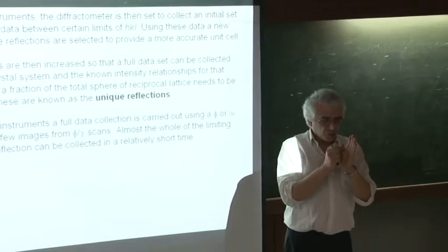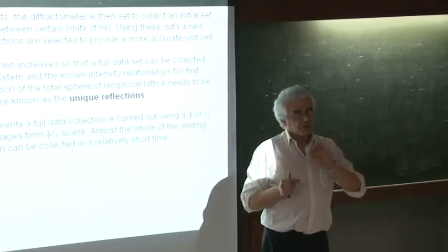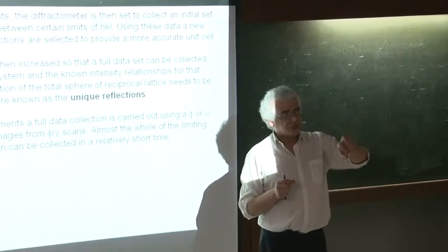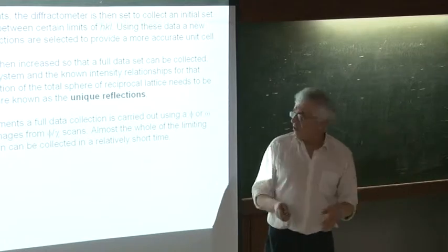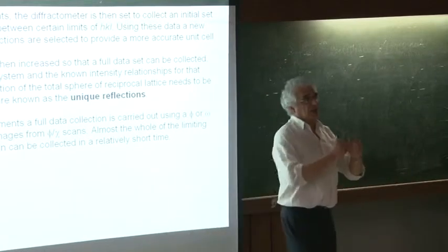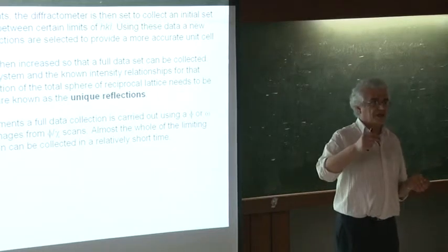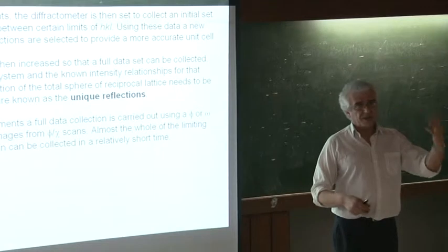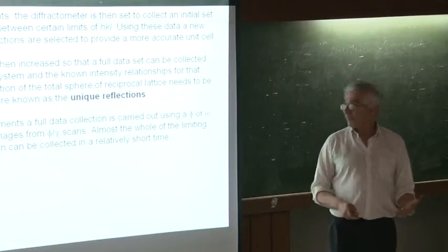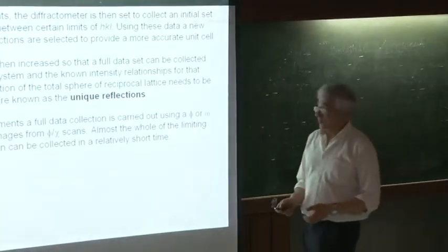Before the peak, after the peak, the height of the peak, the background. We would do a very careful scan to get the intensity. These days, with these images that we get, you collect everything at the same time, and then you do your calculations later by image processing software. So this has speeded up the whole thing.